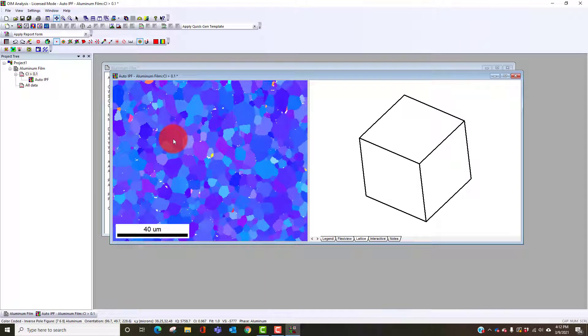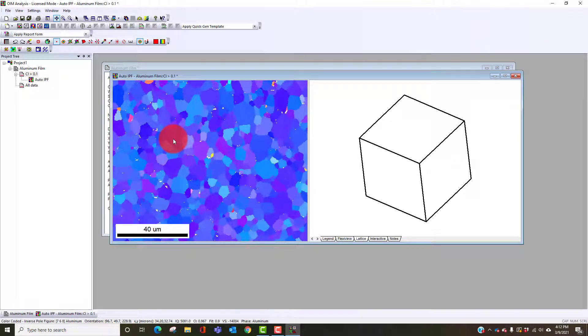What we're interested in knowing is what's the grain size of this film. To do that we have to define what we could call a grain tolerance angle, or what misorientation angle do we consider to be a grain definition.